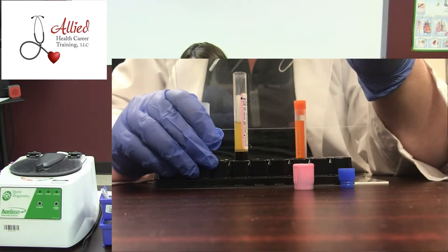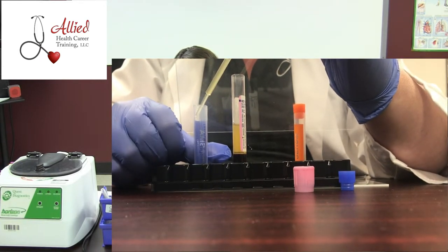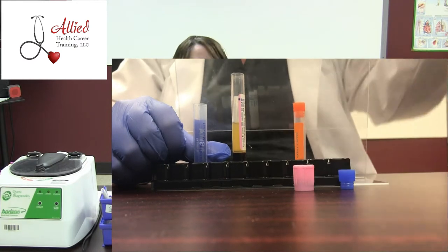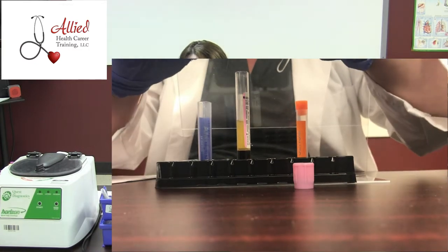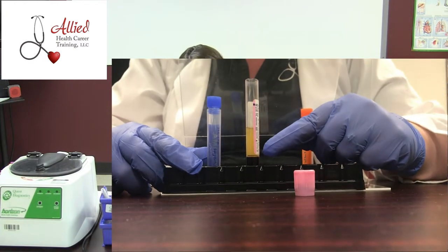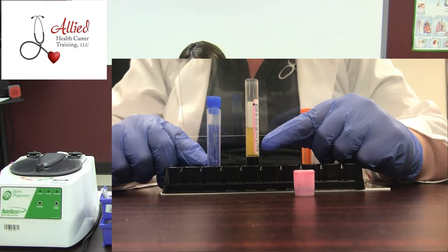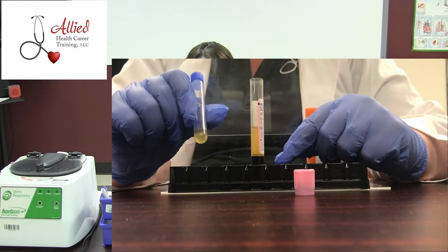Now if you're really good, you won't get any air bubbles. Then we're just going to drizzle it down the side — make sure you don't force the plasma into the tube. Definitely want to put your pipette in a red biohazard bag or trash can. Now this specimen has to have two identifiers, and you're going to want to transfer that information onto your transfer tube because you cannot send it to a lab or leave it unlabeled.